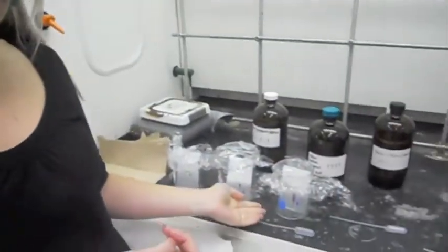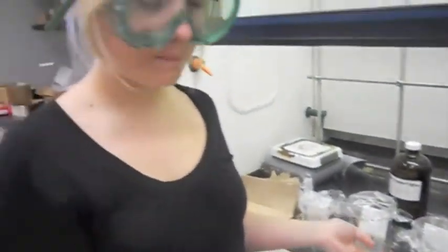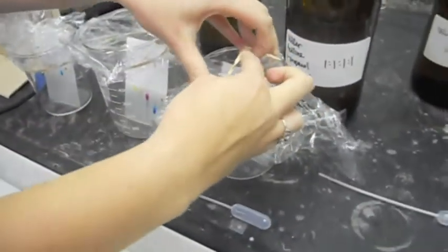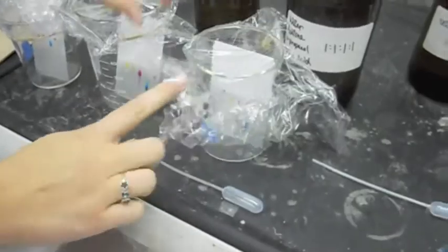The dots were too large and they were not evenly spaced. So this one had evenly spaced dots and they were very small. Make sure to take the TLC plate out before the solvent reaches the top.